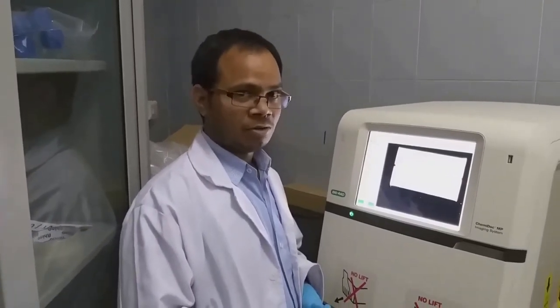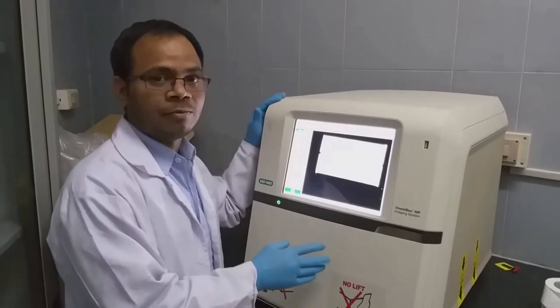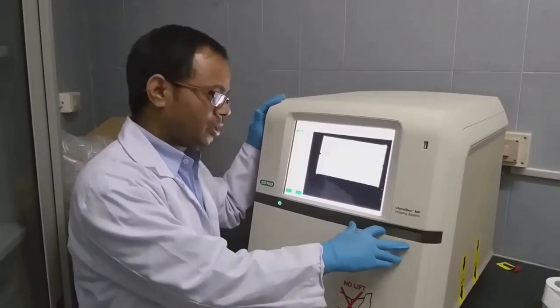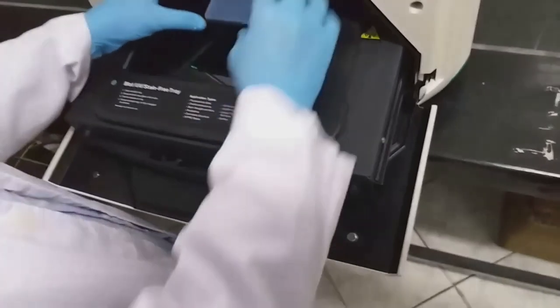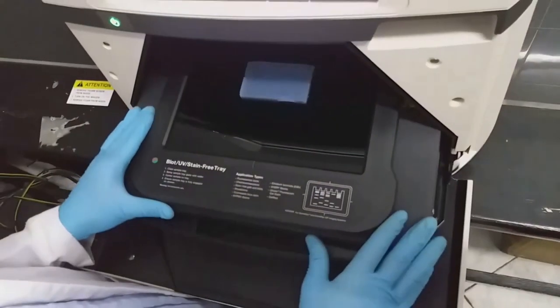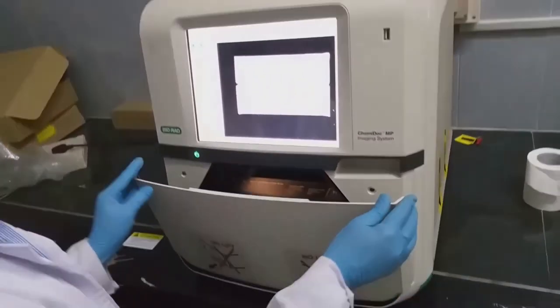After the agarose gel electrophoresis, we have to visualize the amplified product. This is the ChemiDoc MP where we are going to visualize the amplified product. Now we have to keep the gel, then close the door.